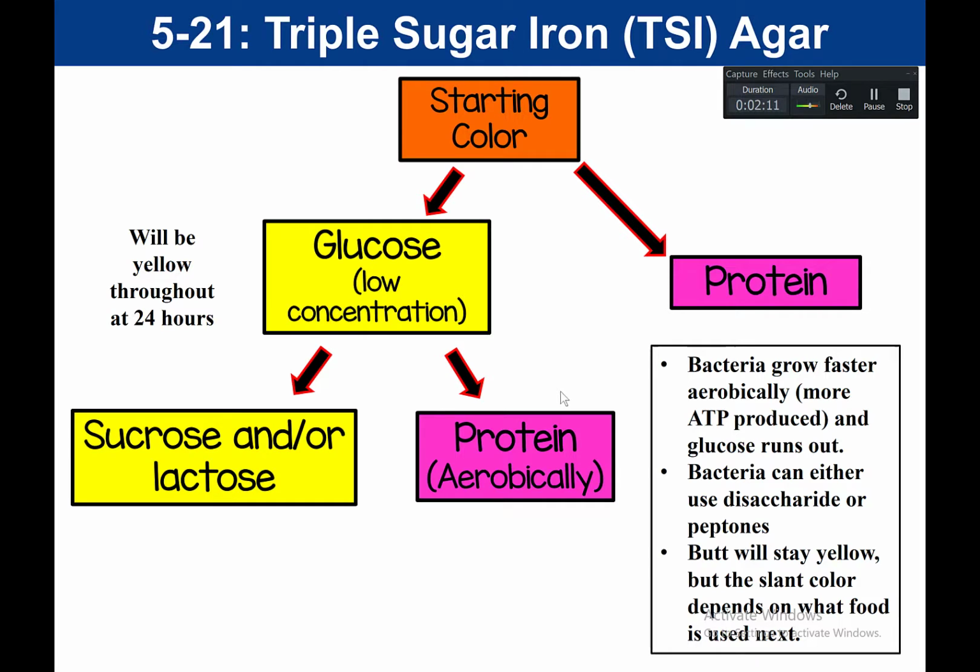And our enzyme would be various endoenzymes, right? This process, this fermentation is by various endoenzymes. And if the sugar is used, the product is going to be acidic. You're going to get acids, alcohol, plus or minus gases, right? Those are your products if the sugars are used.